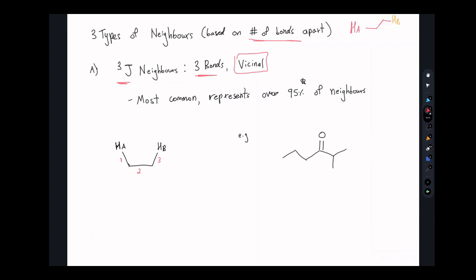Let's quickly discuss this. So let me color code some hydrogens in, and we can talk about the different kinds of neighbors. Here, this red signal, these hydrogens that are on this methyl group on the left side of the molecule, when we look at neighbors, we view the signal as kind of one big piece. We can see that they're all 1 bond away from this carbon, a 2nd bond, carbon-carbon, and there's a 3rd bond that leads to these other hydrogens. We can call them signal B. We can see how A and B then are neighbors to each other.